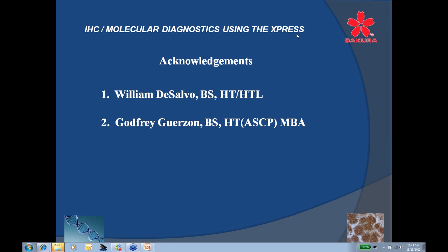But I would certainly say that needs to be moistened with something, whether your fixative is formalin or pre-processing solution or fixative. You need that moistened before you put the biopsy on it. In the past, we had sponge artifact, and that's when we put these biopsies on sponges dry, and they produced an artifact the next morning, which was very difficult to read. But if you moisten the sponge with whatever fixative you're using and then mount the biopsies on it, then it does not produce that artifact.